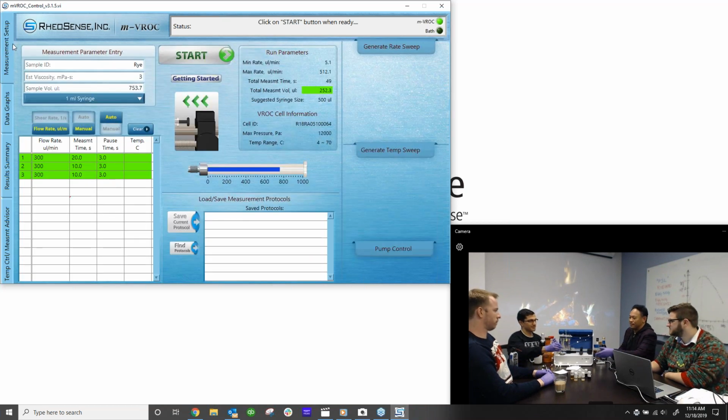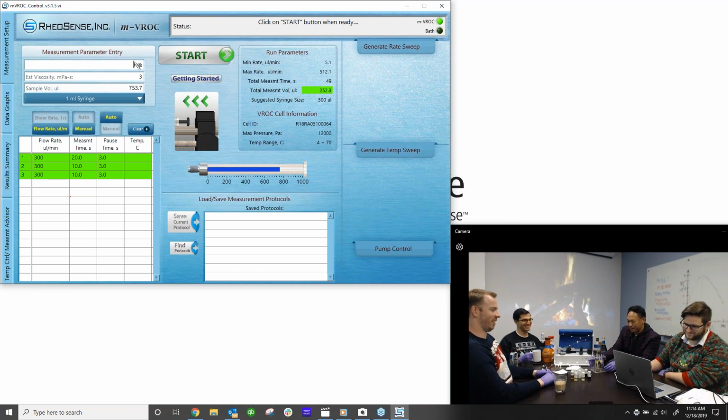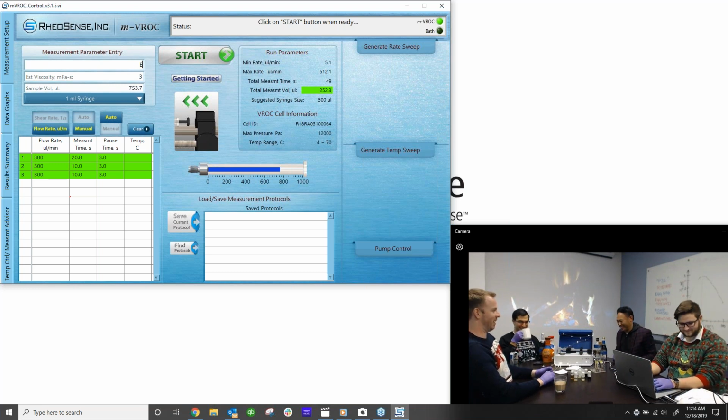All right. So I just have to say I'm really excited to do the next sample. We're doing eggnog. Rick strikes again. Oh, you know it.